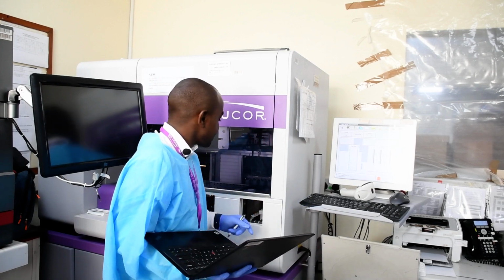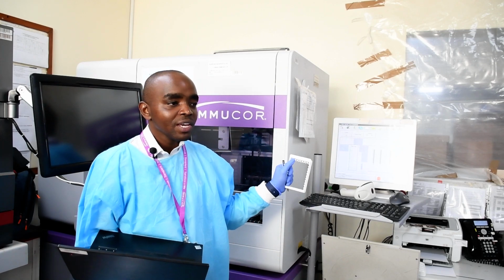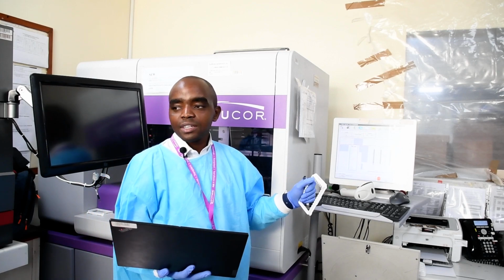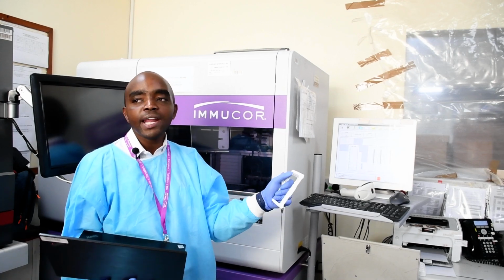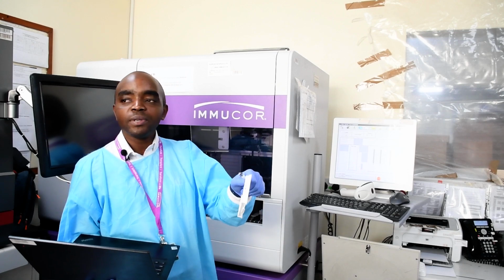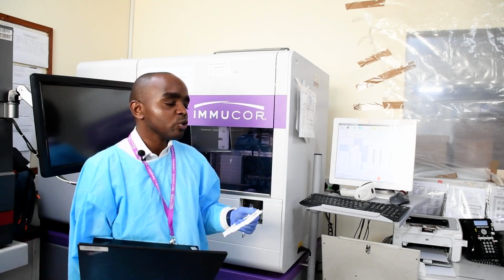So you start, for example, in our case here, we are going to have this well where I know probably you are aware of how serial dilution is done. If you are using tubes, then you have the first concentrated solution, and then you serially dilute it, you double dilute. So probably this is one whole part, this other one will be two whole parts, the third one will be four whole parts. So it's like 1, 2, 4, 8, 16, 32, 64, up to whatever dilution or titration that you want.